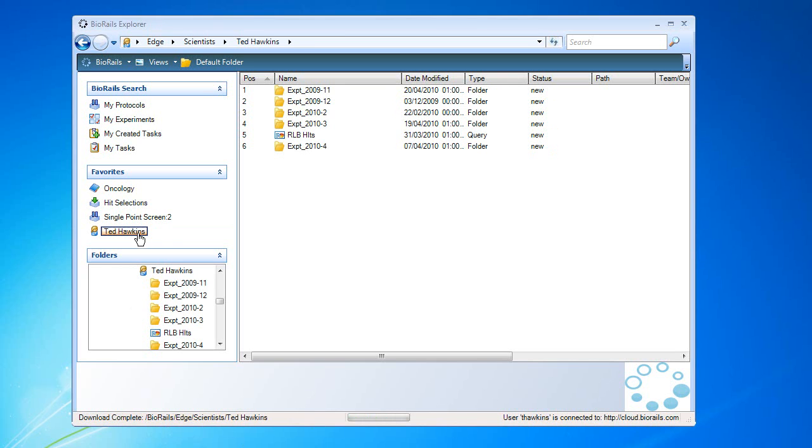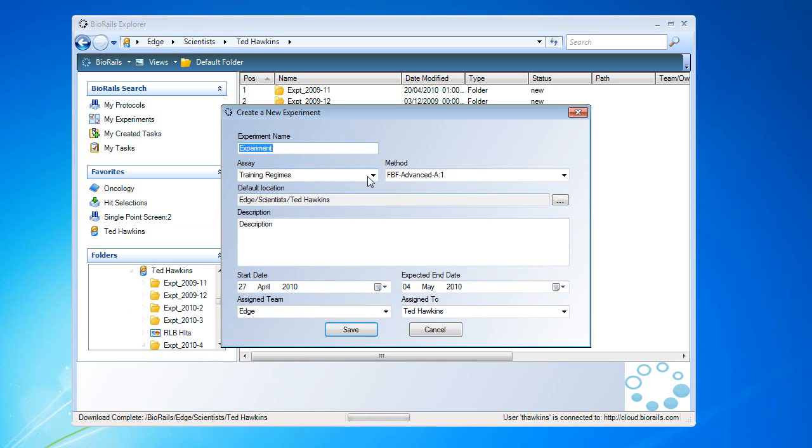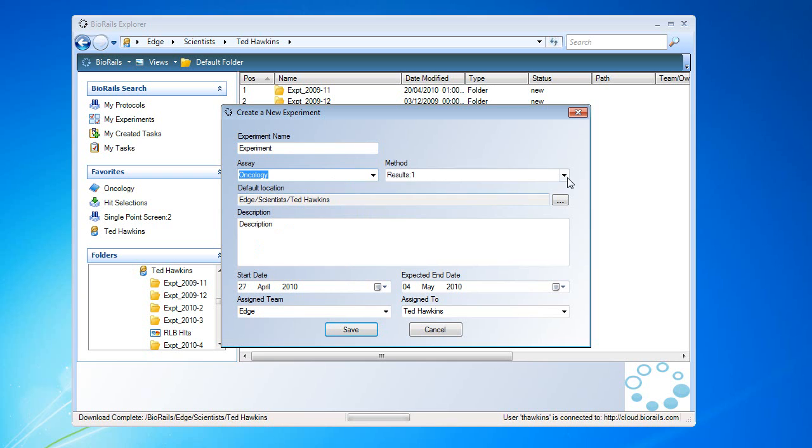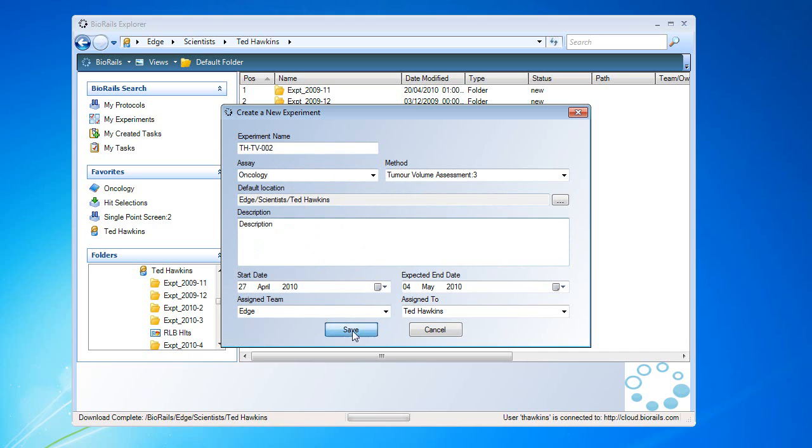I'm going to select my home folder, create a new experiment, and select the method that I want to run. This is a tumour volume experiment. Create a unique experiment ID. We'll save that.